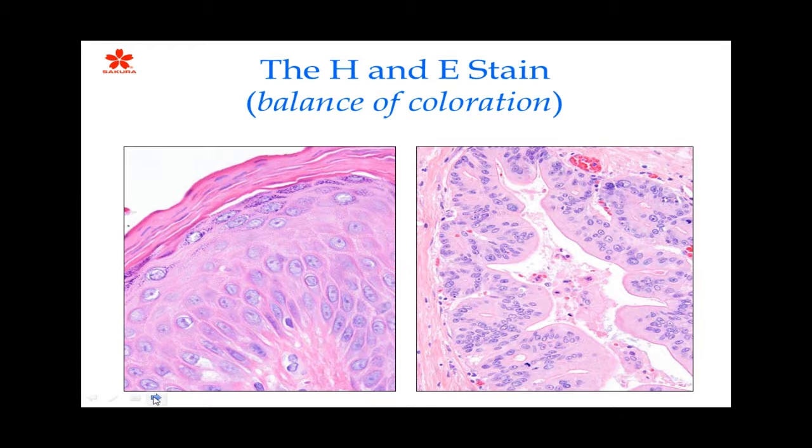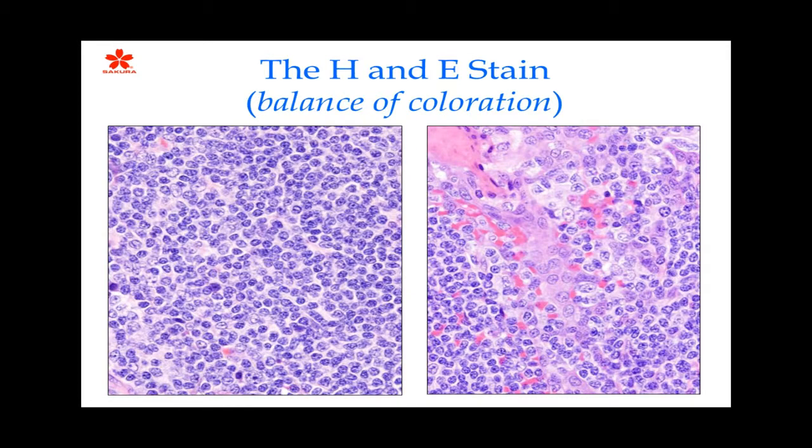You can also see a balanced eosin stain. You can see on the capsule of this, the eosin picking up in the connective tissue. You can see on the right an even sharper nuclear stain, not just a blue dot, but you can see the chromatin material, you can see the nucleolus within the nucleus. And this is what we want to try to achieve.